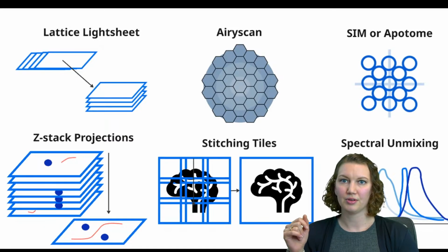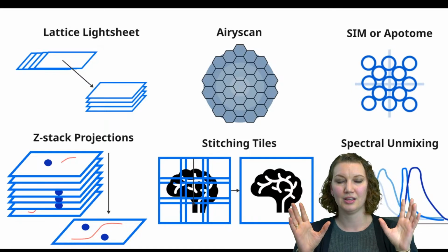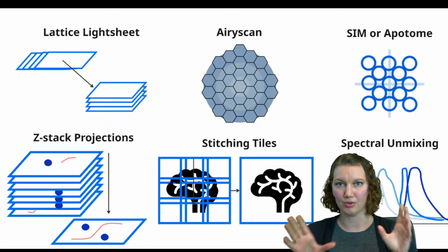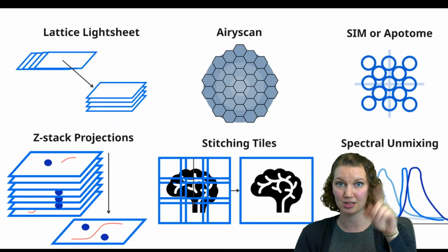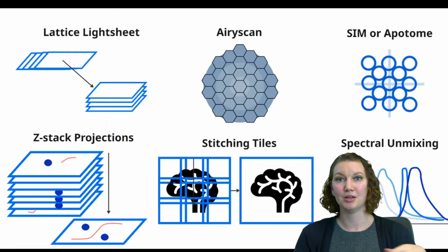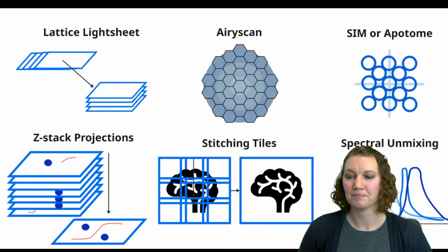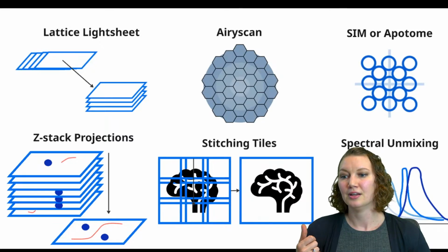And so a little bit of how that actually is set up on the back end, because that's the very basic. If everything has been set up on your instrument, you already know that you have it on your instrument and you're ready to go. You just select that direct processing and set up whatever you would normally set up in the processing tab. But it will start processing for you once each time point is done acquiring, or each position is done acquiring.